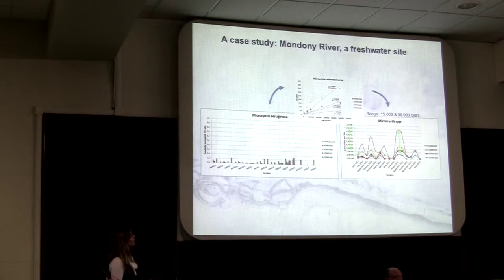The next step was to transform all this fluorescence signal into cell number, because that was the aim of the project. So we used the calibration curves, and we drew for each of the calibration curves the corresponding curve of cell concentration. And you see that according to the probes, you've got a range of cell estimation.